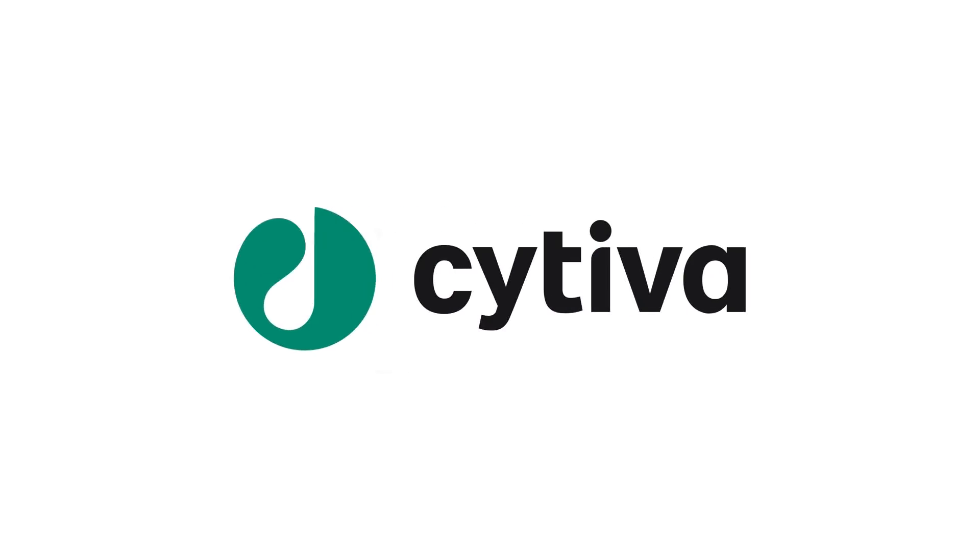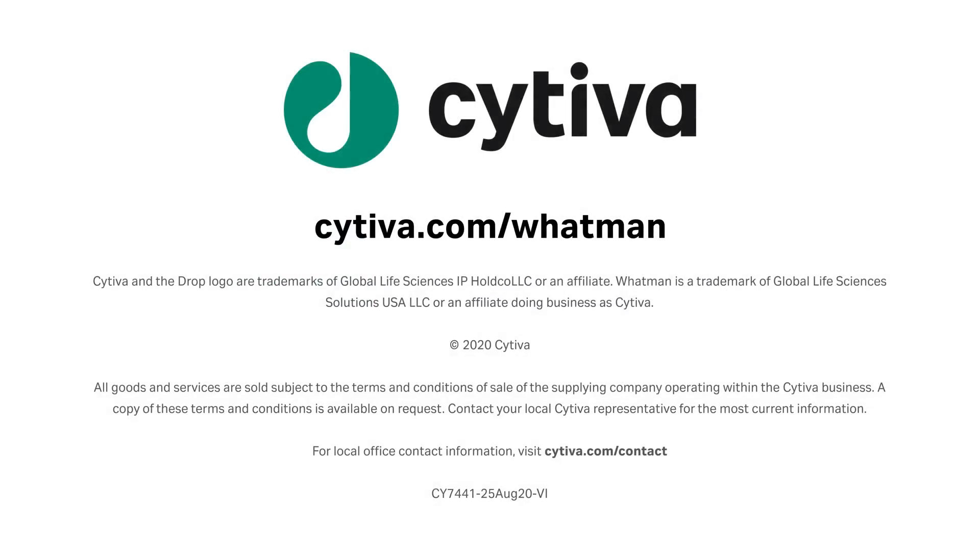So what's the difference? The Whatman 1PS phase separator papers from Cytiva. Designed for convenience, speed, and efficiency.